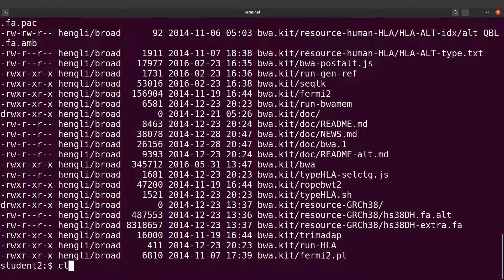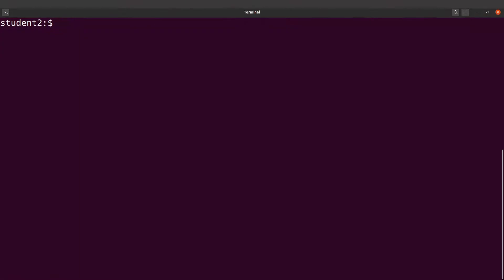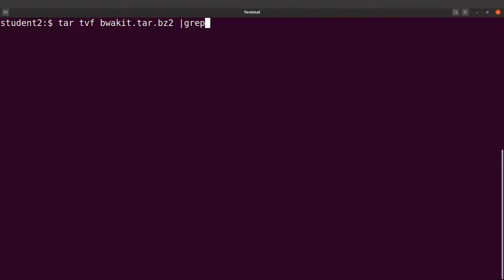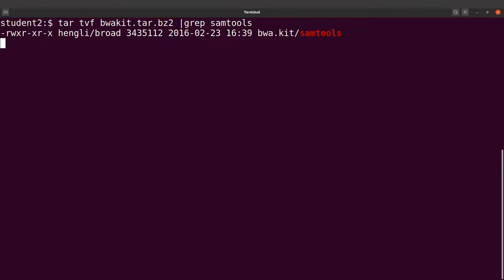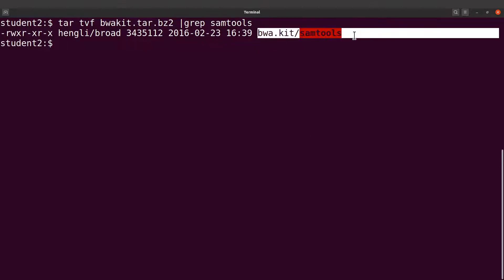We have a lot of contents, so we want to be specific and just get the path for samtools. We say tar tvf, specify the file, and pipe with the grep command to limit output to just the path of samtools. This gives us the path to samtools within the archive — that is what we need.